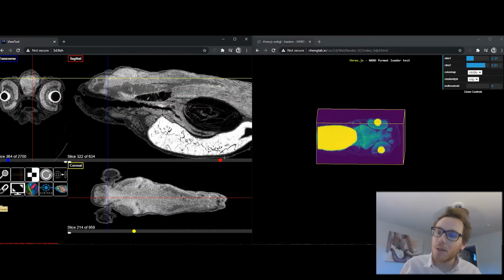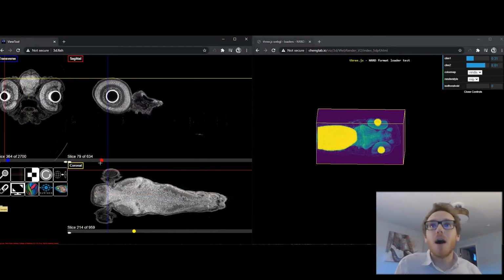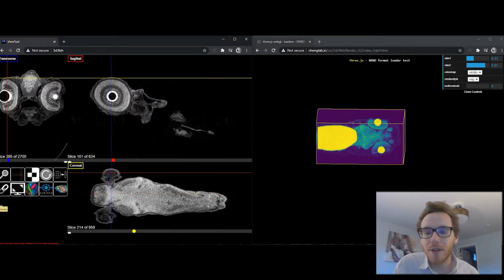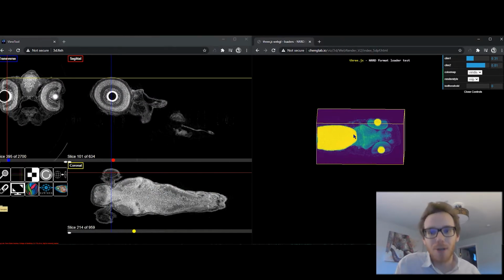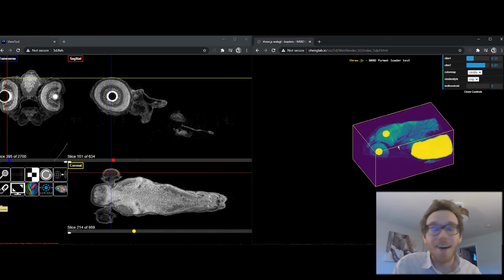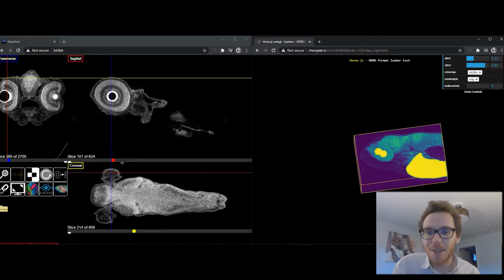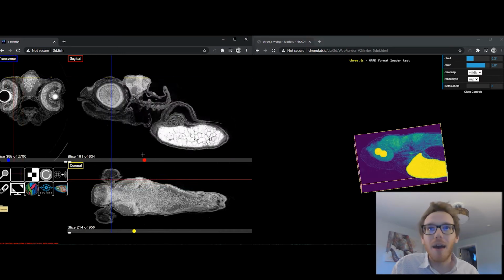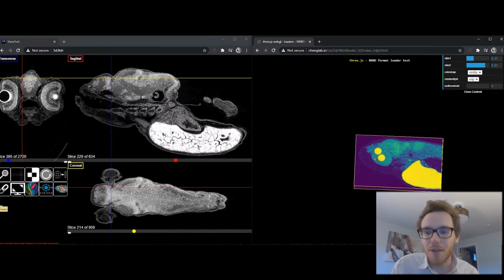Along with a totally revamped labeling system, one of our goals in the very near future is to incorporate an actual 3D component to this viewer. We figured out how to really aggressively downsample our full image stack and interrogate it in a three-dimensional viewer.